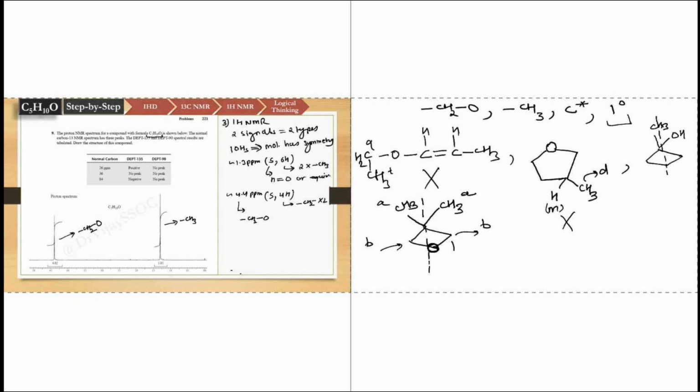So this CH2 can be observed at 84 ppm because it is attached to the oxygen, and second reason, it is in the ring, so it can be deshielded, right? And what about this methyl? This methyl will come at 26 ppm, and now there is a quaternary carbon, and this quaternary carbon will go to 36 ppm. Okay, this compound is satisfying our carbon NMR spectra. And how many carbon signals can you observe? 1, 2, 3, right? So this is satisfying our carbon NMR.